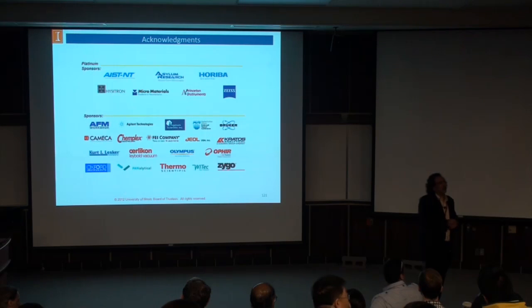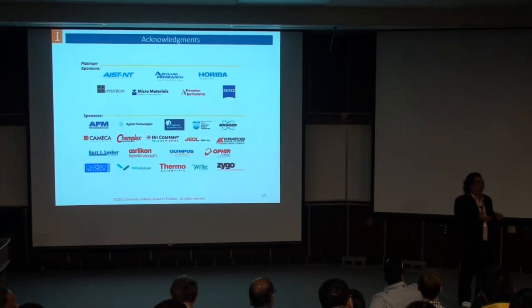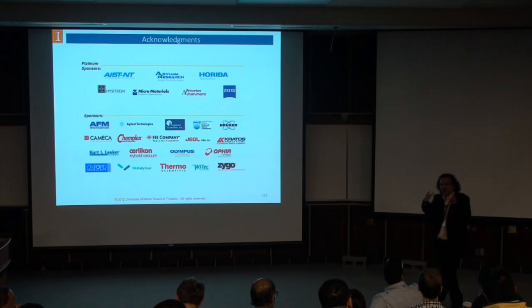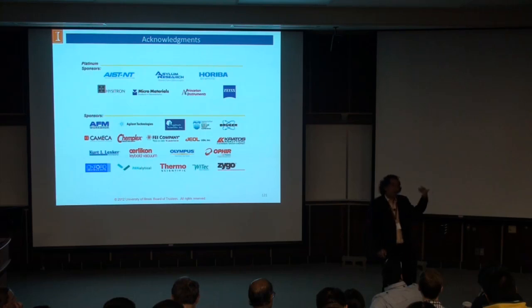Well, I was just looking for something relatively fast. It depends on the instrument you use. In our instruments, for example, if you have a powder, comfortably, a half cubic centimeter will be perfect. We can fill up our cavity holder, fantastic. Now, in other cases I have seen people come with nanoparticles in solutions. They just take a glass slide, drop it there and let it dry a little bit. I say, okay, spread as much as you can. A few drops, and the more you do, the better it is. It also depends on the material.